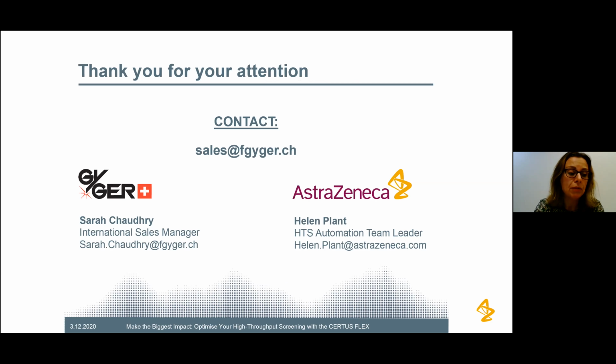maybe half an hour to verify the valves before we start off the run every morning. We do choose to do this. We found it is beneficial in terms of data quality. Because of the number of plates we run per batch, we'd rather spend half an hour and verify and check our correction factors before we start off. They do change slightly, but not significantly, but we like to just check that.